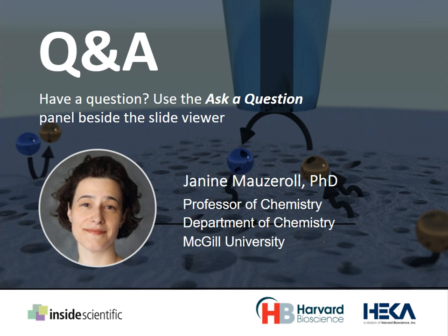I think there's also a nice group in Germany that used SECM to monitor dendrite growth at lithium electrodes. I'll have your question, and I can suggest a couple of papers specifically for battery materials if you're interested.